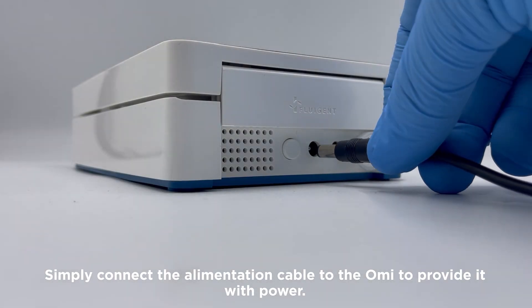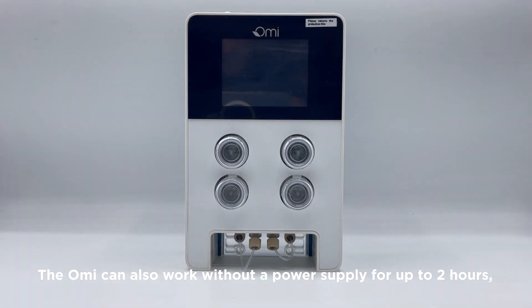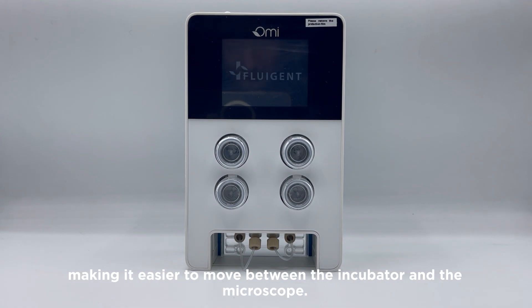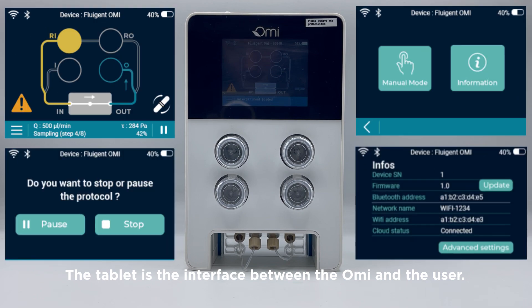Simply connect the alimentation cable to the OMI to provide it with power. The OMI can also work without a power supply for up to two hours, making it easier to move between the incubator and the microscope.